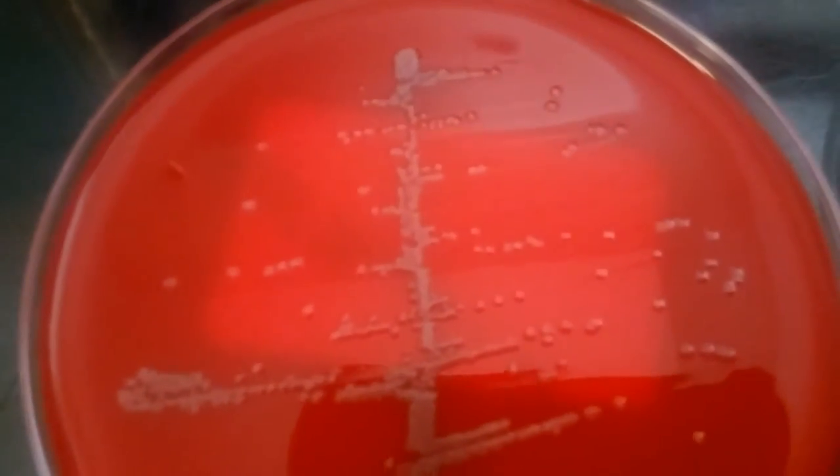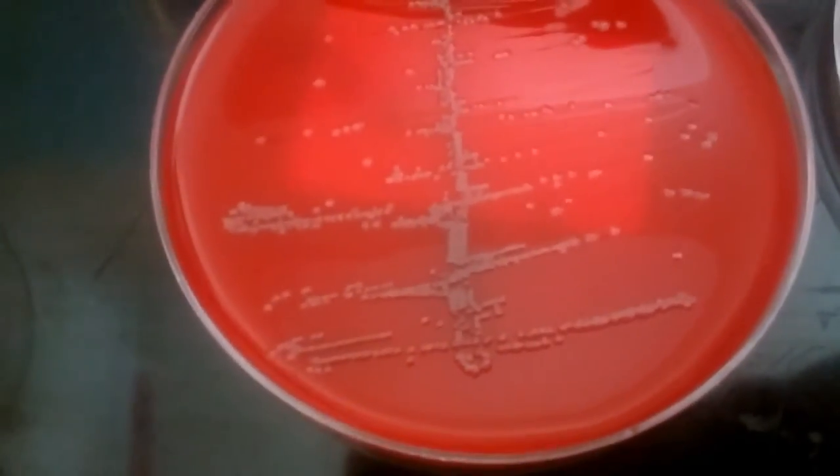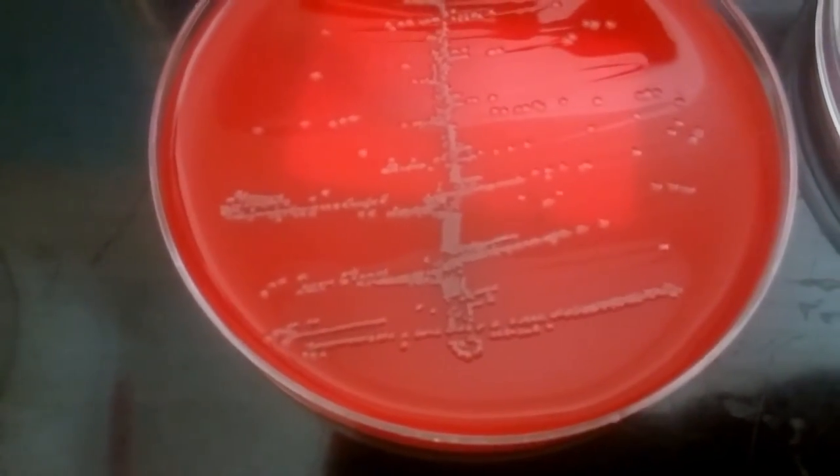Pretty small colonies, but this is a young culture. It hasn't been grown for that long. So there's that one.